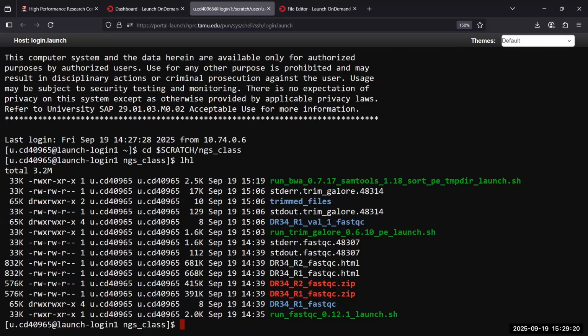Okay, so you need to copy that line. A very long line here. Just highlight it out. Okay, and then go back. And on line 28, you want to replace that big, yeah, not the whole line, starting with the scratch.